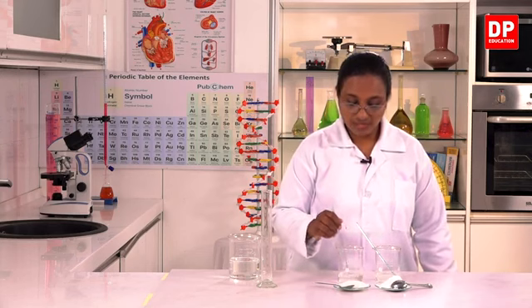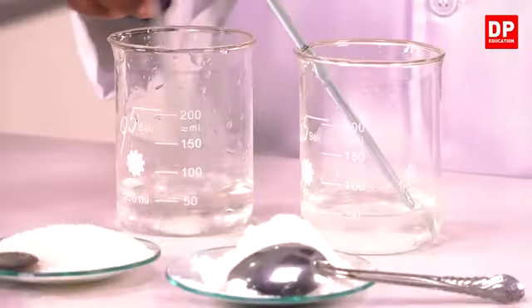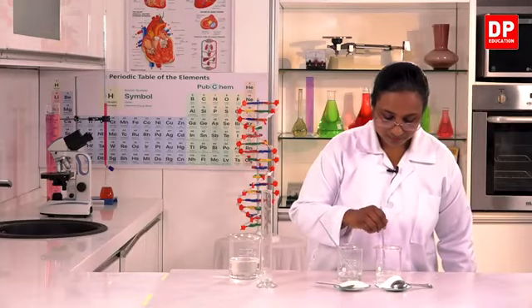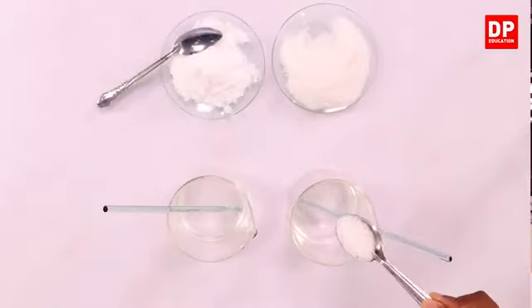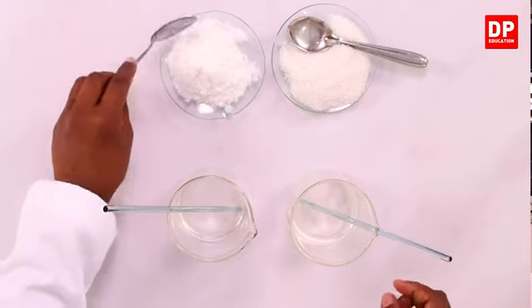So you can see when both the solutes dissolve, we get clear, transparent solutions. Okay. Now I am going to add another spoonful of both the solutes, sugar and salt.